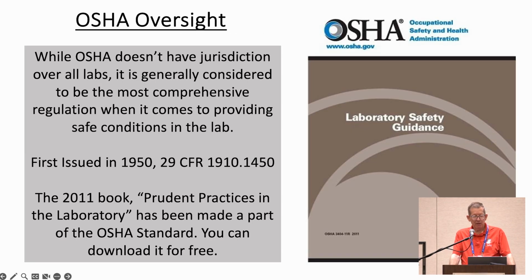Okay, so general oversight in the United States is either federal OSHA or state OSHA. And the standard is 29 CFR 1910.1450. And what does it say about fume hoods? Absolutely nothing. It just says, make your lab safe. You know what to do.